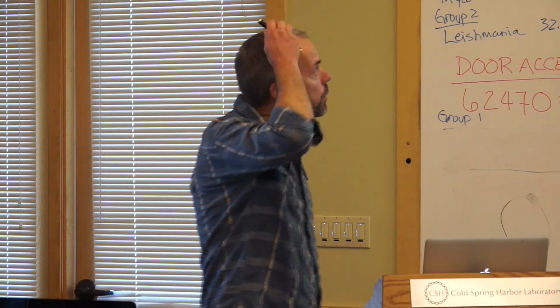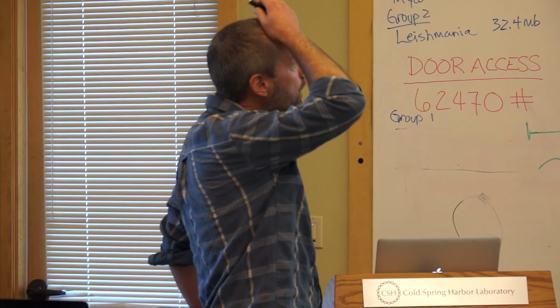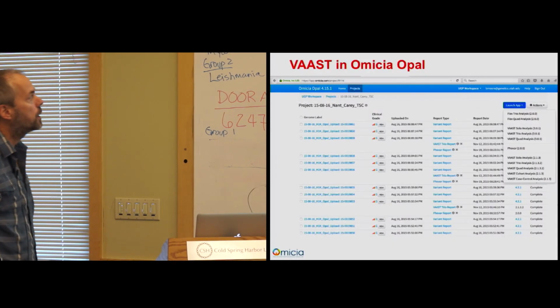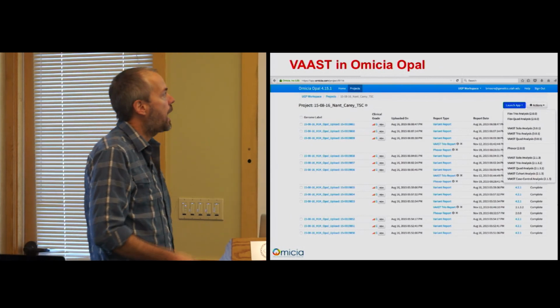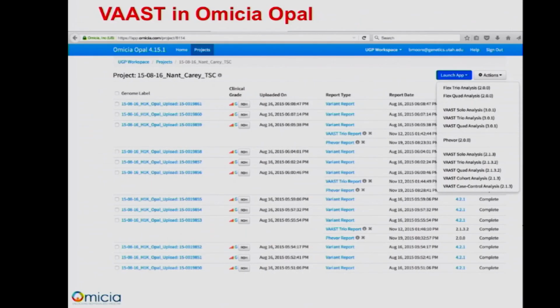Okay, so just in closing then, I will describe a tool out of Martin Reese's group at Omicia, a biotech startup in the Bay Area. They've been active in VAAST development from the beginning, and their target is really the clinical domain. So medical geneticists at clinical diagnostic labs, or perhaps even physicians who are genetically aware and have genome sequence in a hospital.